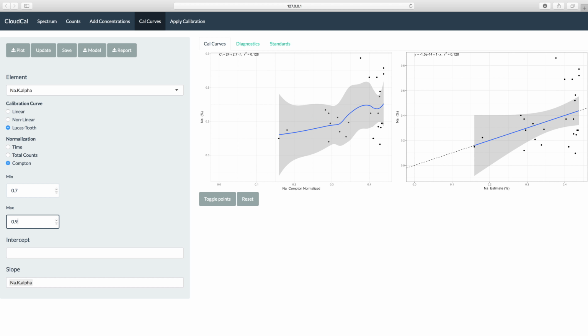Technically, we are not normalizing to Compton here. We're normalizing to the, and I apologize, my German colleagues tell me that I mispronounced this word, but we're looking at the Bremsstrahlung radiation, which is basically the random X-ray backscatter that occurs when you throw electrons against something dense.